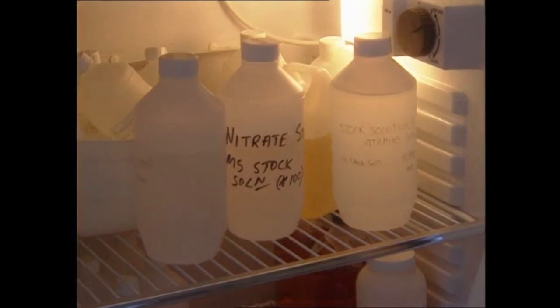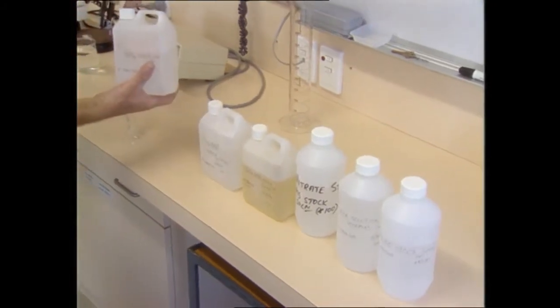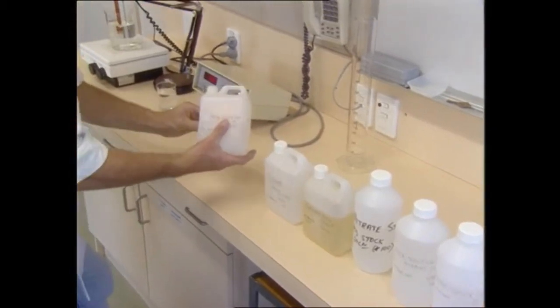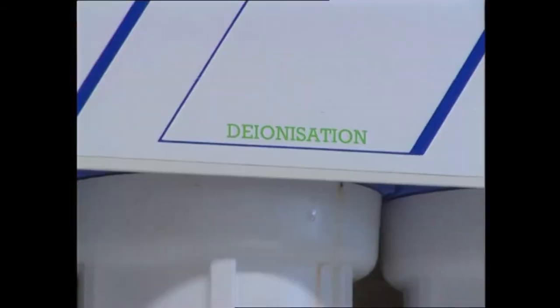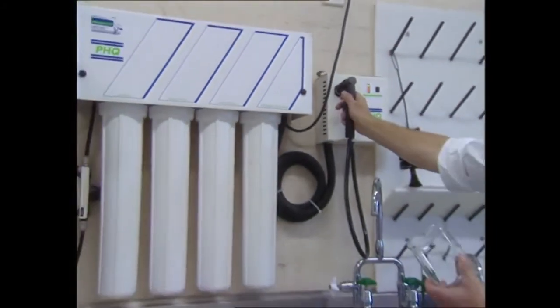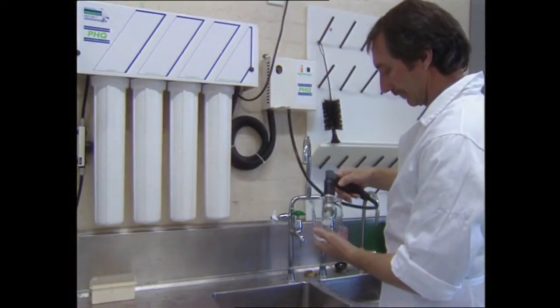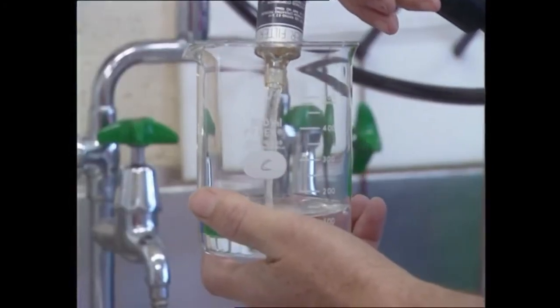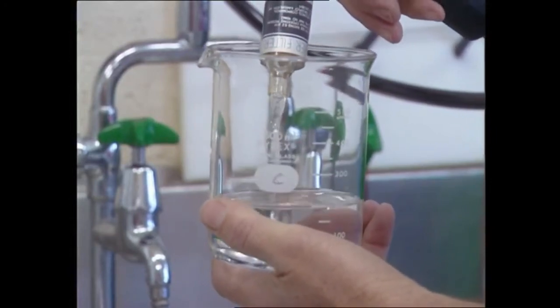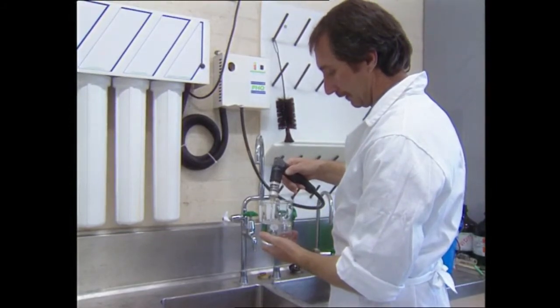The final choice will very much depend on the quantities of the media you are preparing and the facilities in which you are working. To prepare media, simply measure the quantity of stock solutions or add the correct amount of powdered medium to deionized water. It is important that the water used for tissue culture be deionized. Deionized water can be purchased from many supermarkets or water purification companies. Large laboratories normally have their own purification plant.